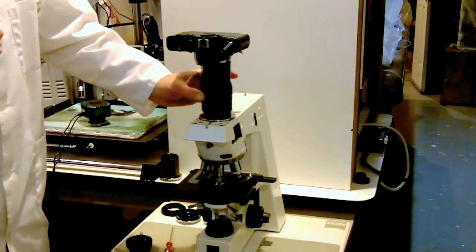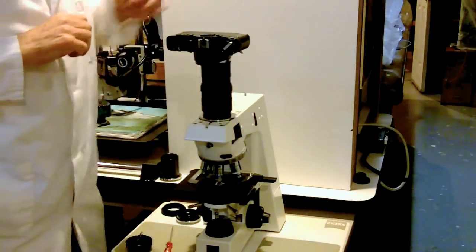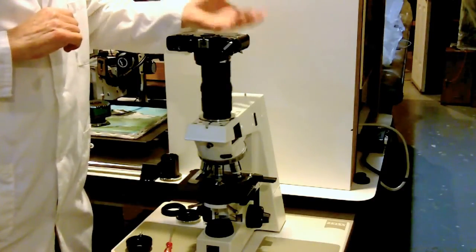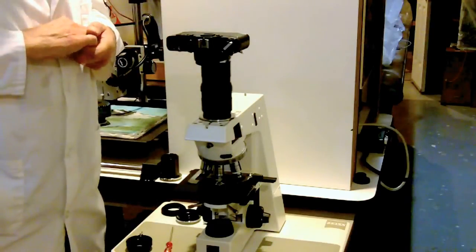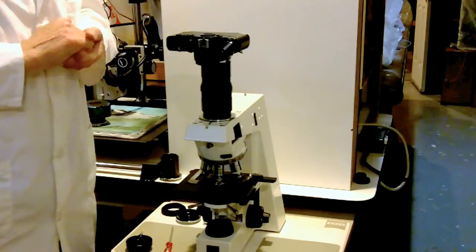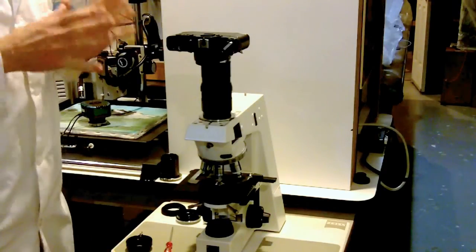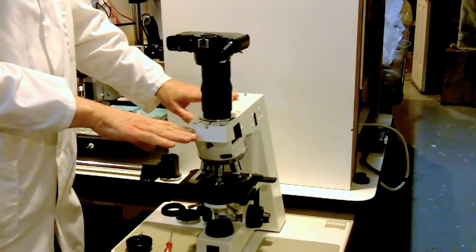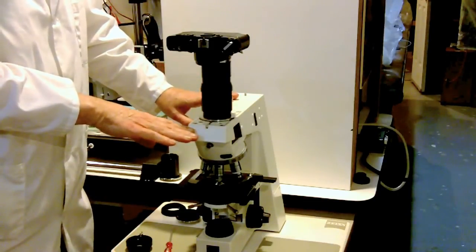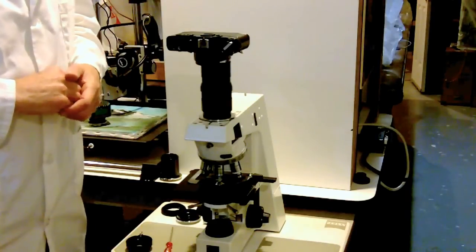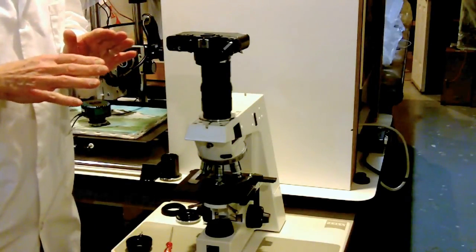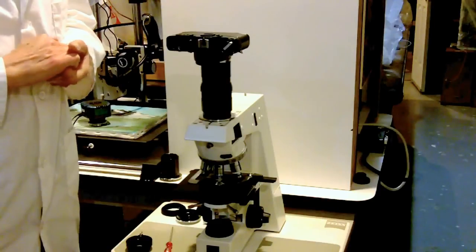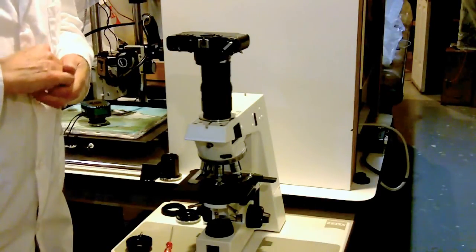So we now use the DSLR camera, for example, with a USB out to go directly to a computer and do all of our focusing and all of our microscopy from the computer display. We don't need eyepieces anymore. Many labs don't even use the eyepieces. They just do their serious photography. And this converts a rather run-of-the-mill microscope stand into a dedicated photomicroscope. You wouldn't want to do this for routine viewing. This is really for photomicroscopy and serious digital imaging type work, such as Z-stacking for extended depth of focus and things like this.